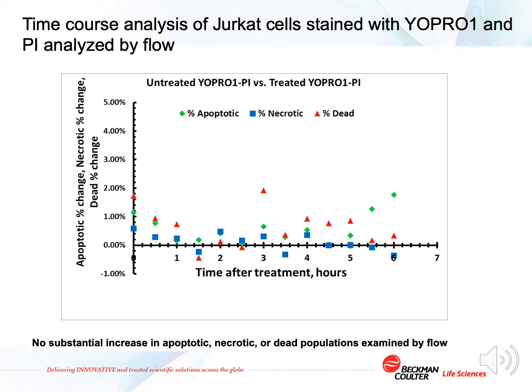When analyzed by YO-PRO-1 and propidium iodide staining with a Cytoflex, also no substantial increase in apoptosis, necrosis, or cell death was observed during the 6-hour period in the treated versus the non-treated cells.